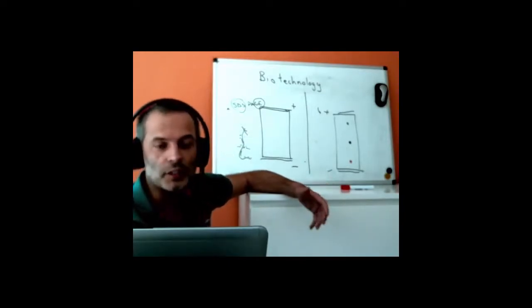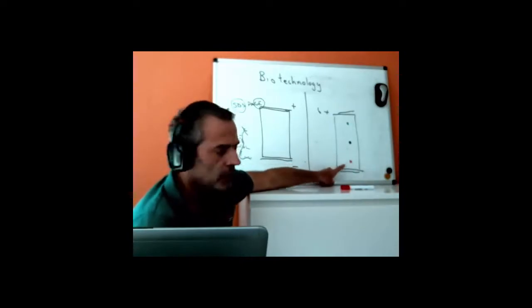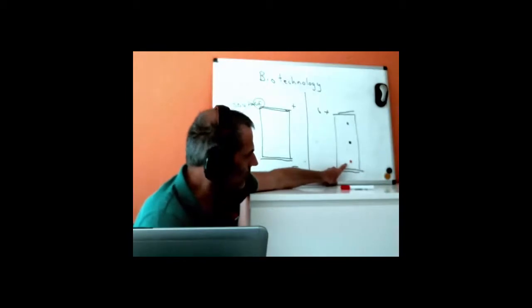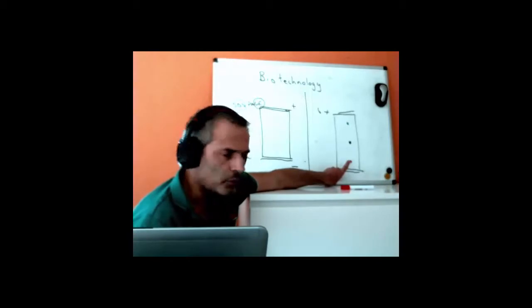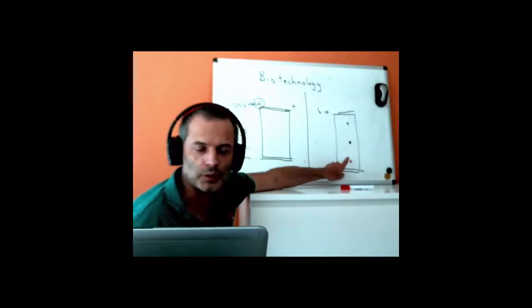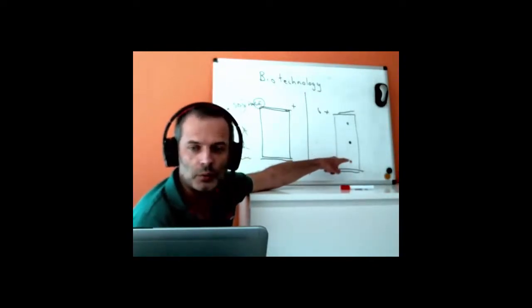Because the molecule has no charge at its point of zero charge, there is no force on the molecule at that point. So if we take this red one, which is relatively basic, if it moves slightly down, it gets into a more basic region, it gets slightly more negatively charged, and then it gets pushed back upwards, in this case, to the red dot. Maybe it goes past, it becomes protonated, gets more positively charged, and then it gets pushed back to the exact place it was before, and the protein can stick there.